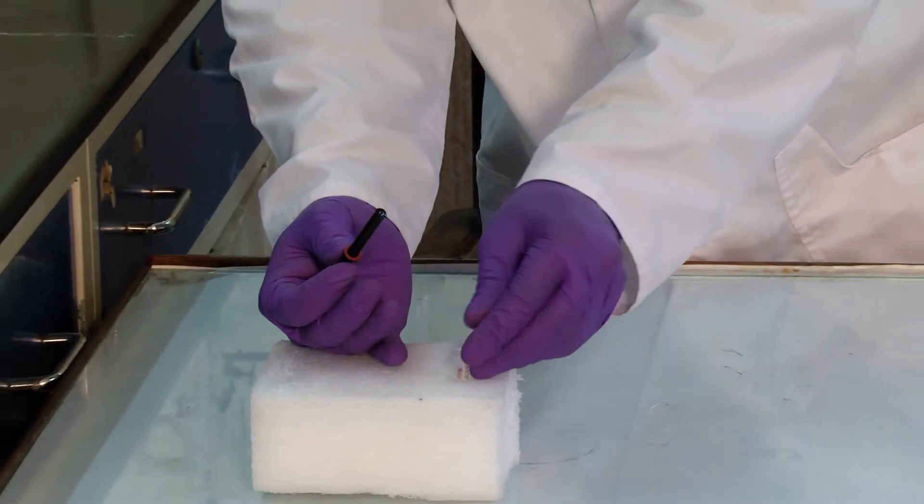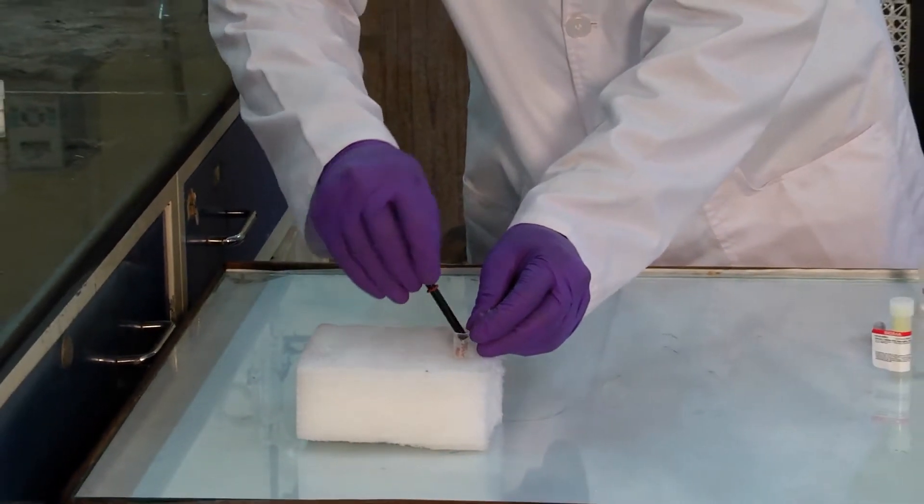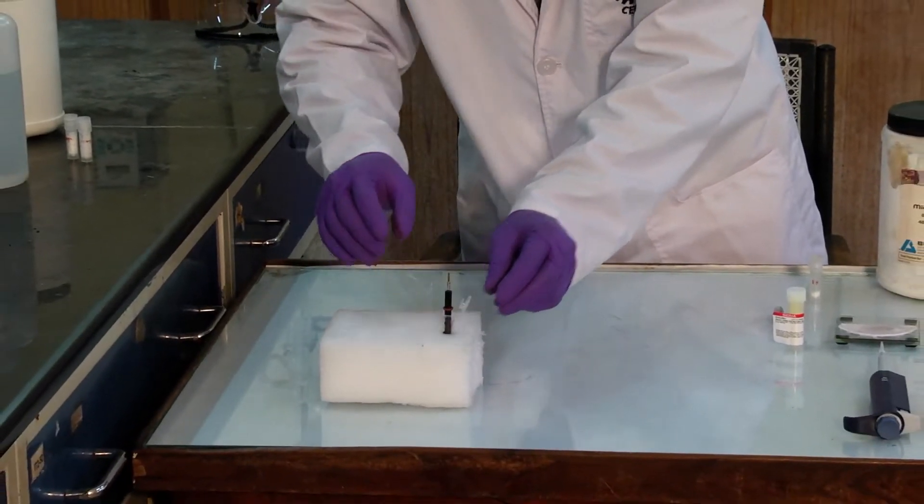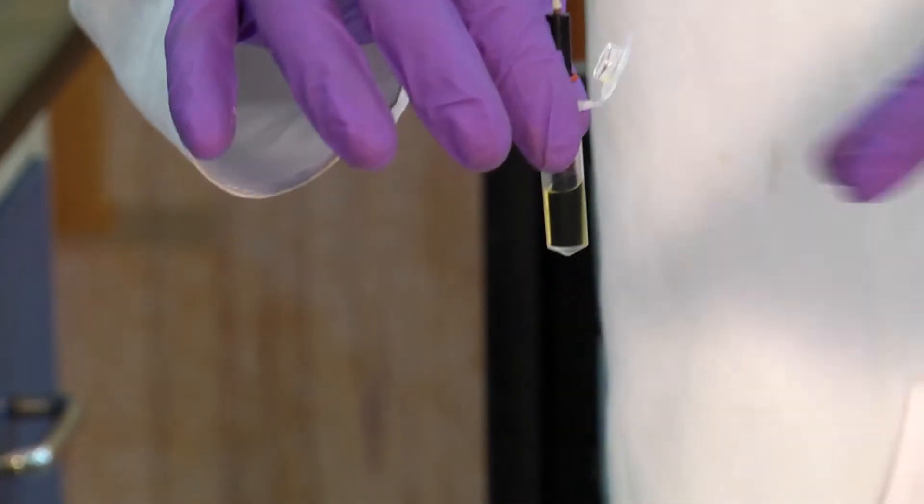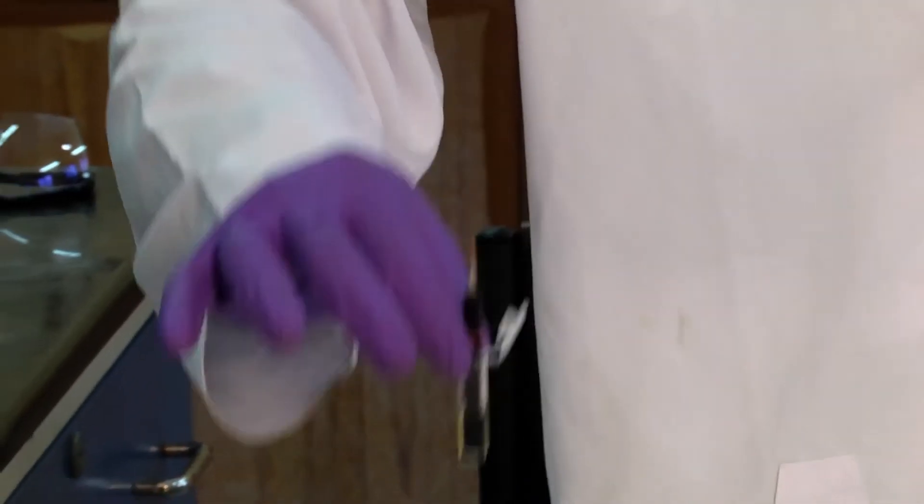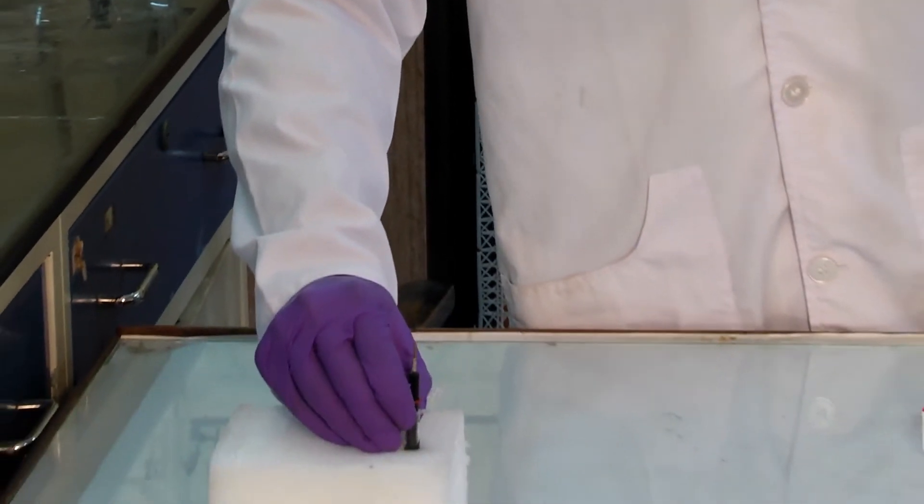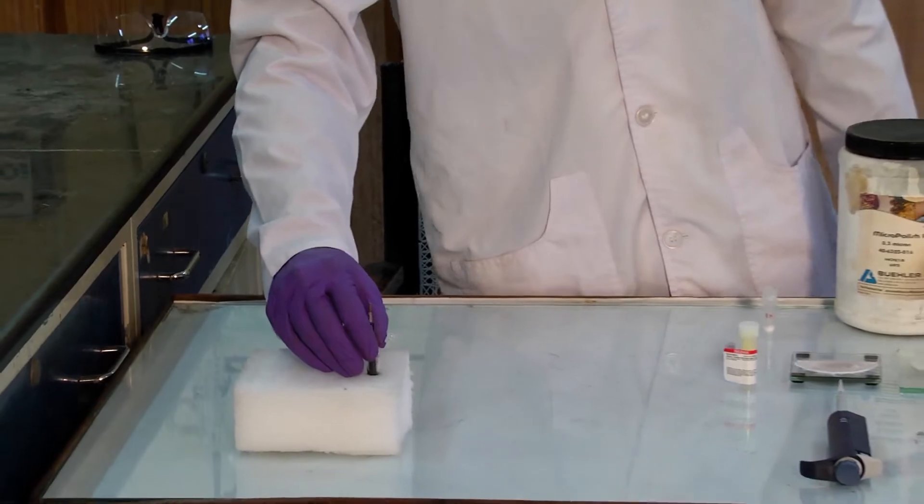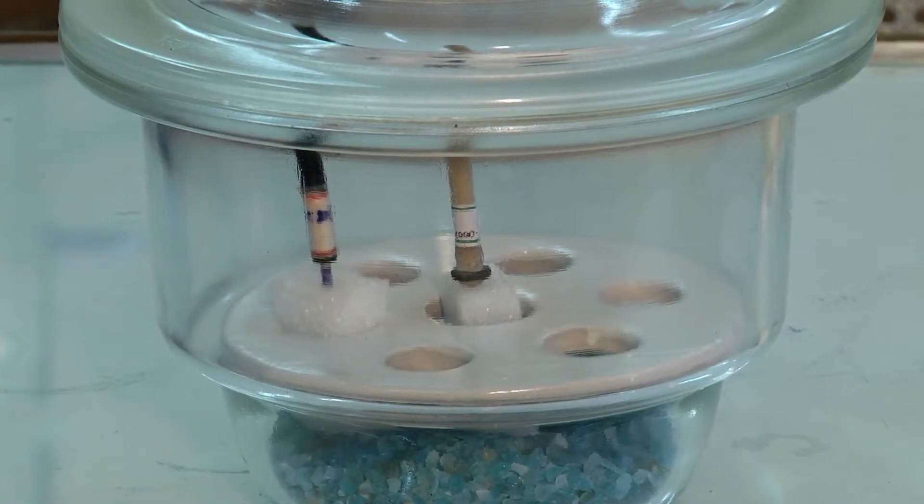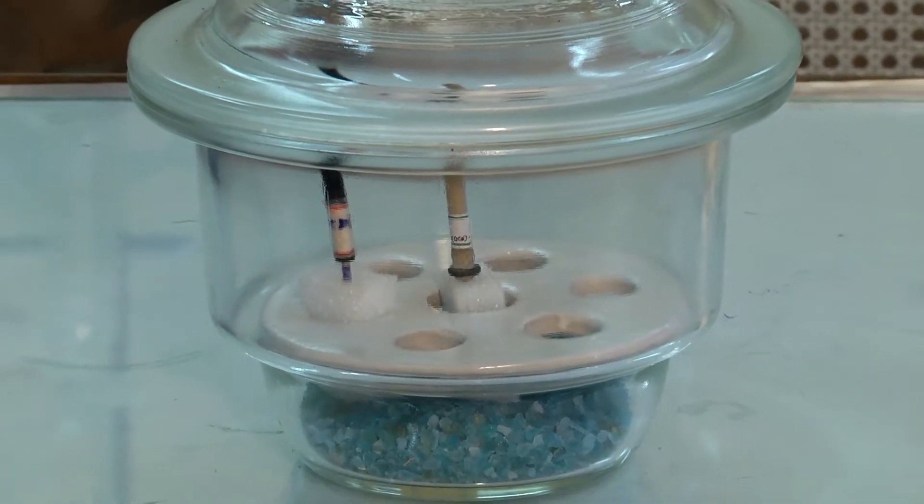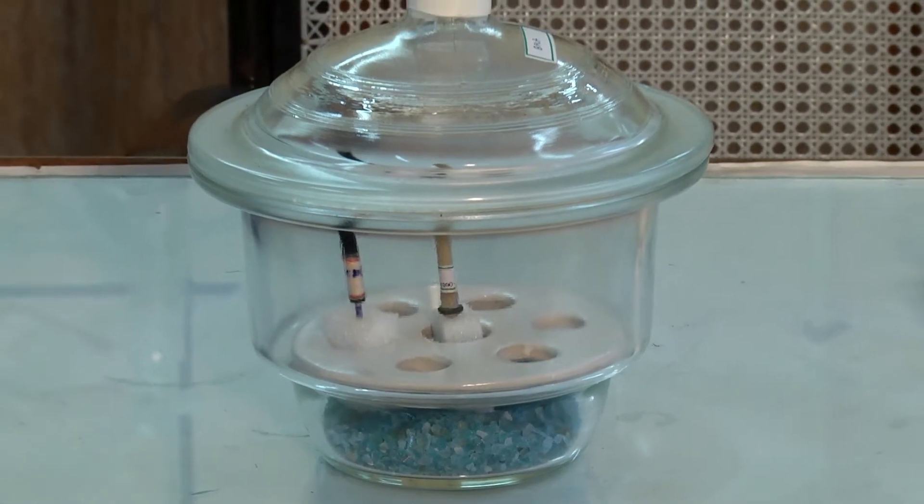Then this modified electrode is dipped in glucose oxidase enzyme solution for at least 6 hours. This process helps in the adsorption of enzyme on the multi-walled carbon nanotubes coated electrode. Finally, it is stored in the desiccator before analysis.